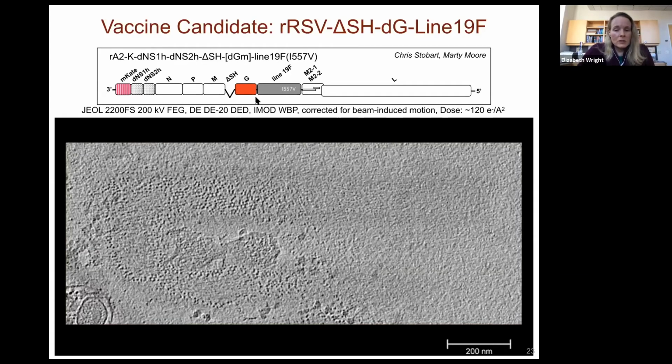Now G is present on the virus surface, but is also present just in suspensions of the virus. So it's a released complex. And so by codon deoptimizing G, what he hoped to do was reduce the amount of G on the surface of the particles, as well as what would be present in loose form.